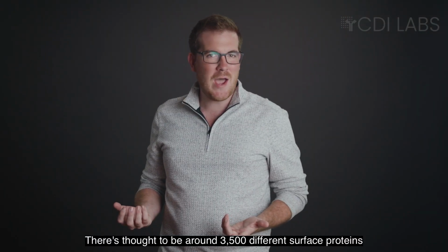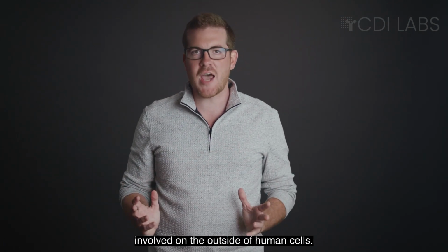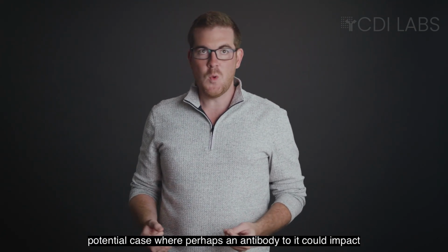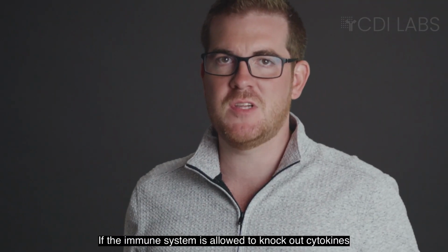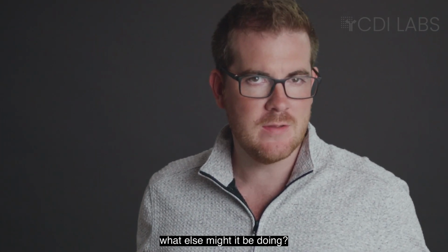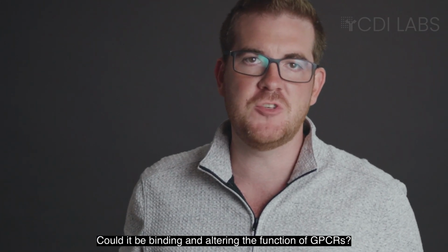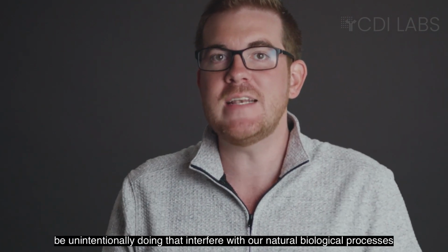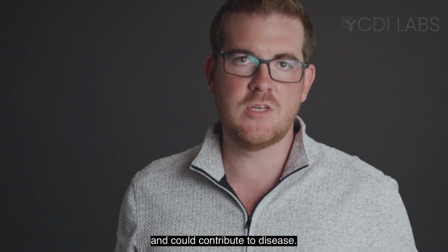There's thought to be around 3,500 different surface proteins involved on the outside of human cells, and each and every single one of those is a potential case where perhaps an antibody to it could impact its function. If the immune system's allowed to knock out cytokines, what else might it be doing? Could it be knocking out cytokine receptors? Could it be binding and altering the function of GPCRs? These are all other things that the immune system might be unintentionally doing that interfere with our natural biologic processes and could contribute to disease.